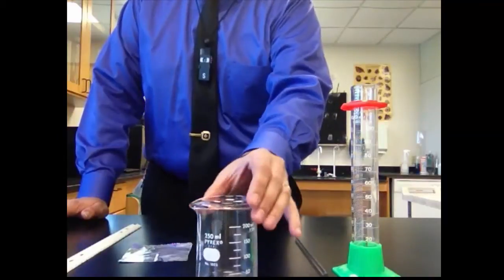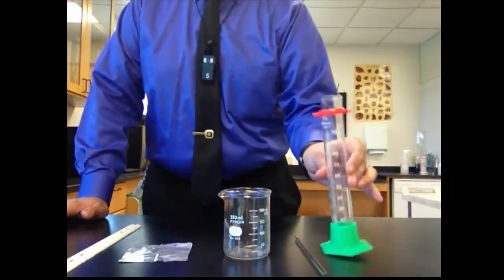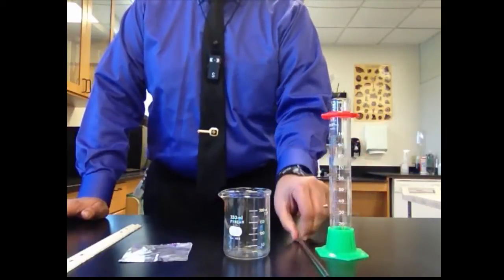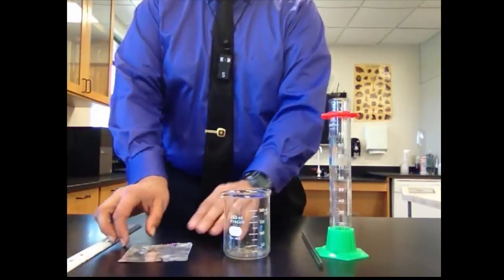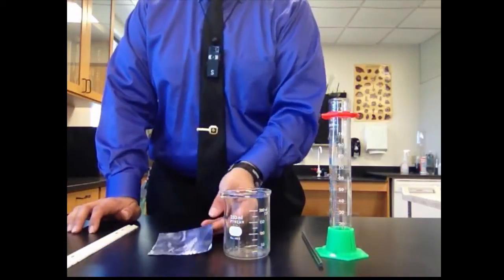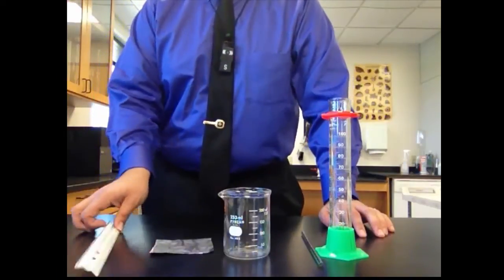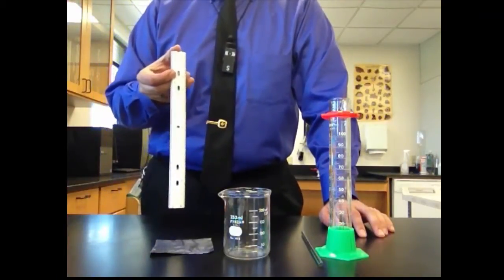We have this, we know what this is. This is a 250 mL beaker. And we have a 100 mL graduated cylinder. We have a stirring rod. We have a square, more or less, of aluminum foil. It may not be a perfect square, but that could come into play later on at the end of the lab.